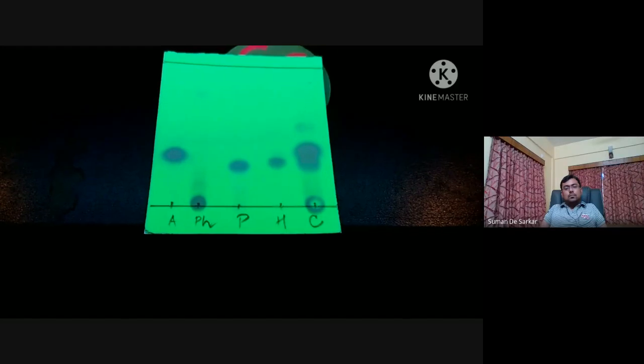Also, you can see already from here, the color of the product is much brighter than the acetophenone. Although the acetophenone spot and product spot are quite close to each other, the Rf value difference is not much. The second spot, the phenyl hydrazine, is very polar because of the presence of the two nitrogens, and those are strongly binding with silica. Acetophenone and the product are quite close. And this hydrazone spot here got hydrolyzed on silica, that's why it's mainly showing the spot of acetophenone.